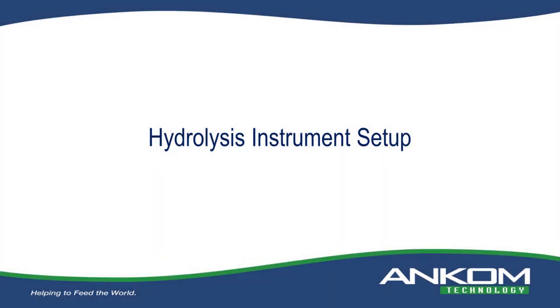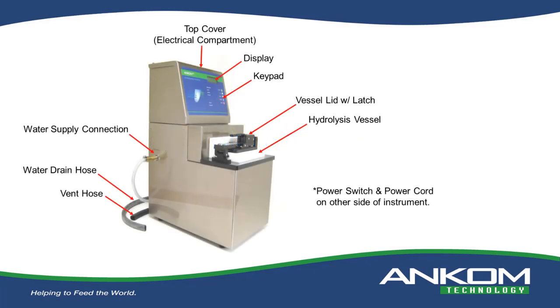Let's begin our session with hydrolysis instrument setup. This is a picture of the hydrolysis instrument, and you can see the different features of the instrument indicated there with many different arrows. What you cannot see, as indicated on the bottom right hand side, is that the power switch and the power cord are on the right side of the instrument as you face it, so you really can't see that in this picture.